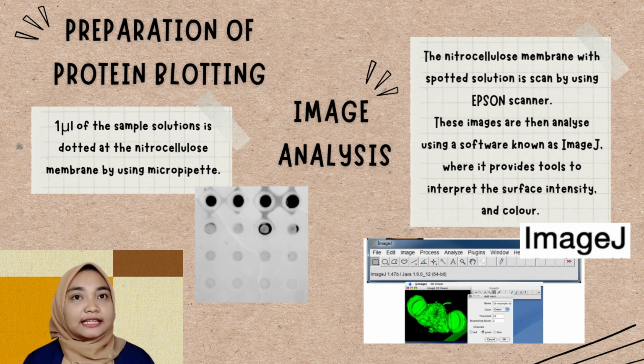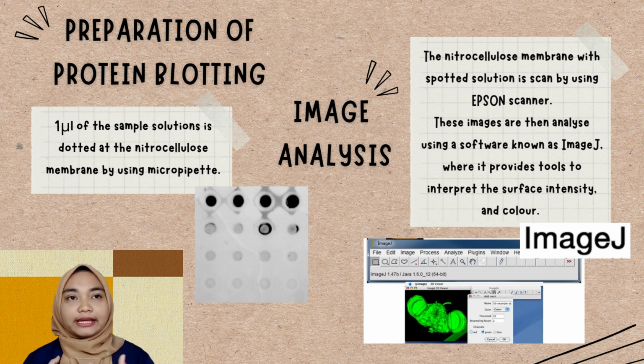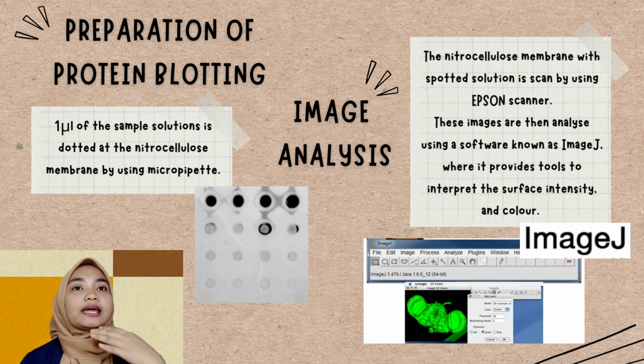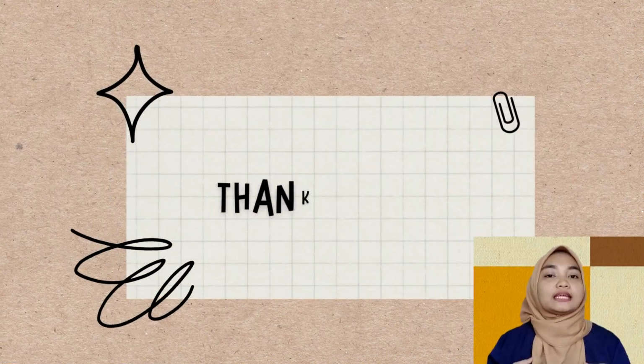So lastly, my research is to control the final deposition pattern of an evaporating droplet without changing its composition. It may be achieved by altering the dynamics of internal flow using external forces, which is temperature that I use in this study, without using a chemical additive. The temperature is one of the factors that can help to obtain uniform or homogeneous patterns of color droplet for CRE suppression. I think that's all from me.